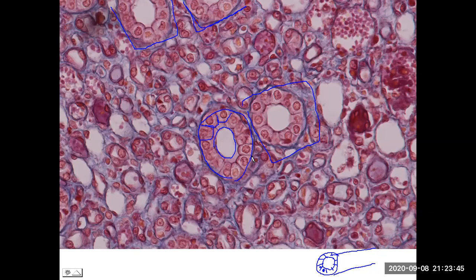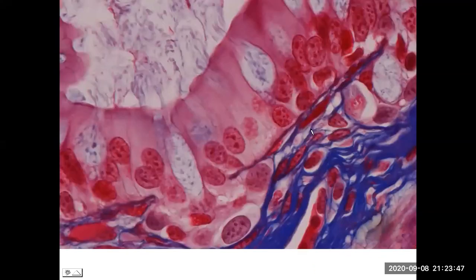And then another simple example, single layer. In this case, the basement membrane would be located here. Let's put BM, typically found just at the very deep edge of epithelial tissue. And now we could highlight the cell membrane. We'll see that these cells have much more length when compared to their width. So these long, slender cells, again, here they are adjacent side by side, but no stacking. So this is simple columnar epithelial tissue, simple columnar.